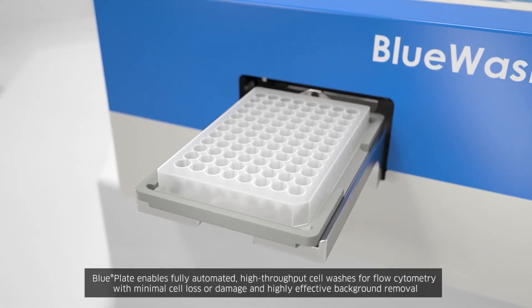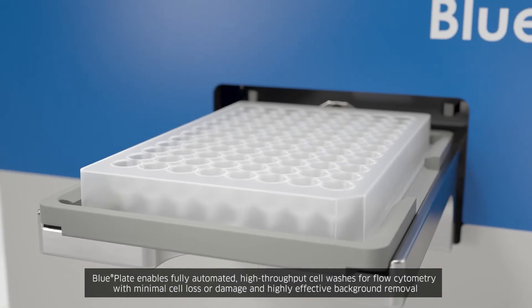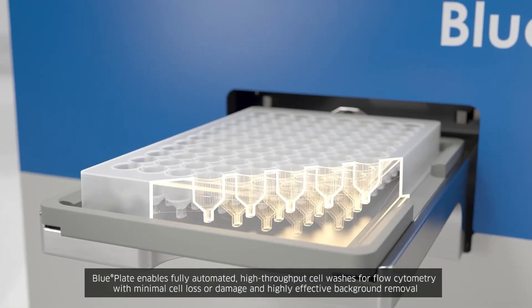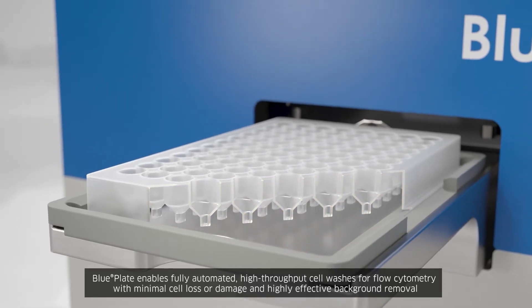BluePlate enables fully automated, high-throughput cell washes for flow cytometry with minimal cell loss or damage and highly effective background removal.